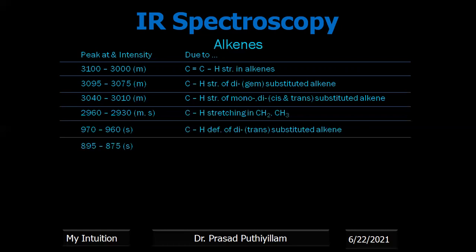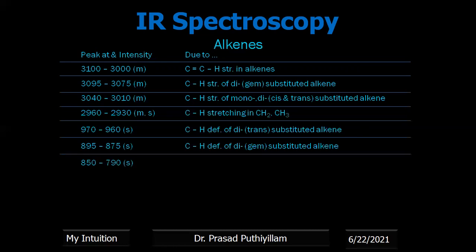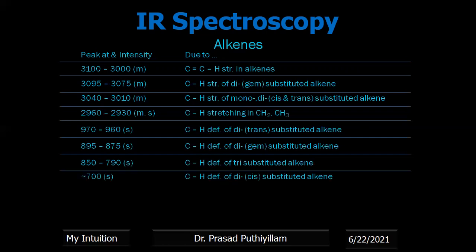Around 895 to 875, a strong band is due to CH deformation or bending of geminal disubstituted alkenes. 850 to 790 is due to CH deformation or bending of tri-substituted alkenes. And approximately around 700, a strong peak is obtained if it is a cis disubstituted alkene. Around 700, a strong peak.